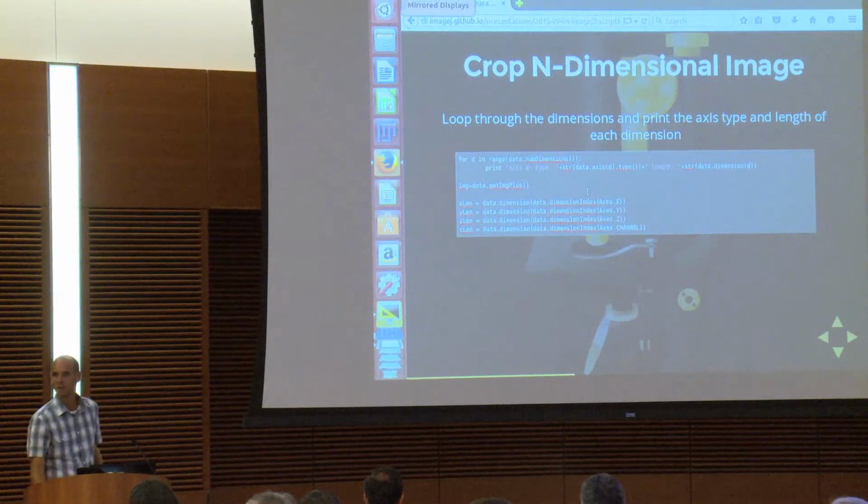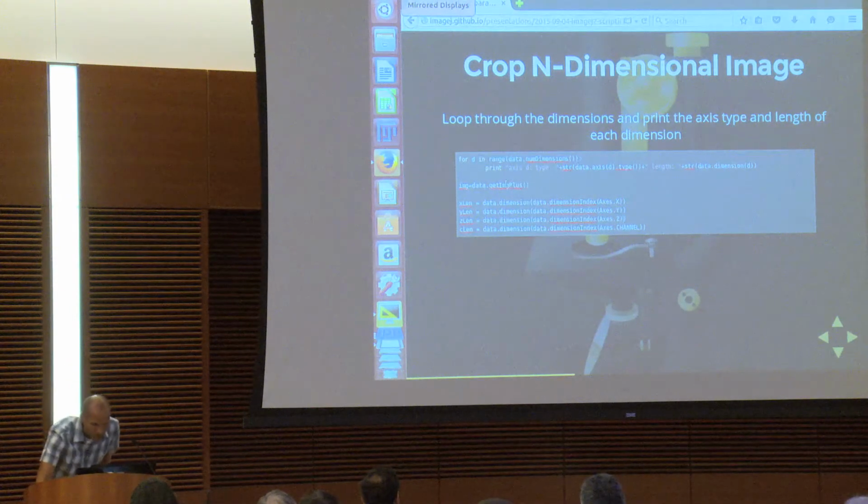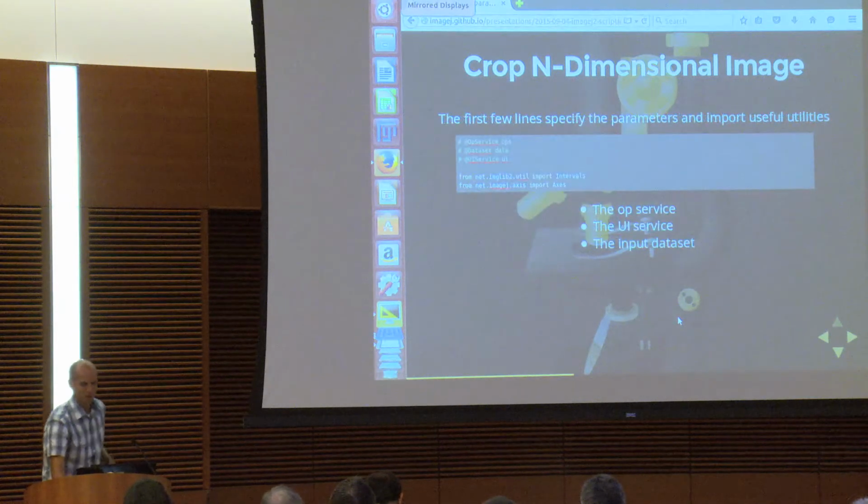How do all these commands know that you're referring to the image? IMG is where you get the image plus, and all the loops and the x index and all that are in reference to IMG. Okay, that's a really good question. Let's go back a step.